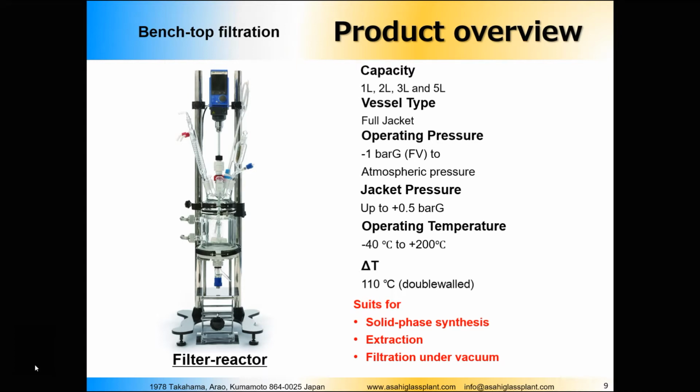But the problem is that the thickness of the glass doesn't allow the heat to pass through the glass to the other side and to start the same expansion on the other side of the glass, which is in contact with the air.